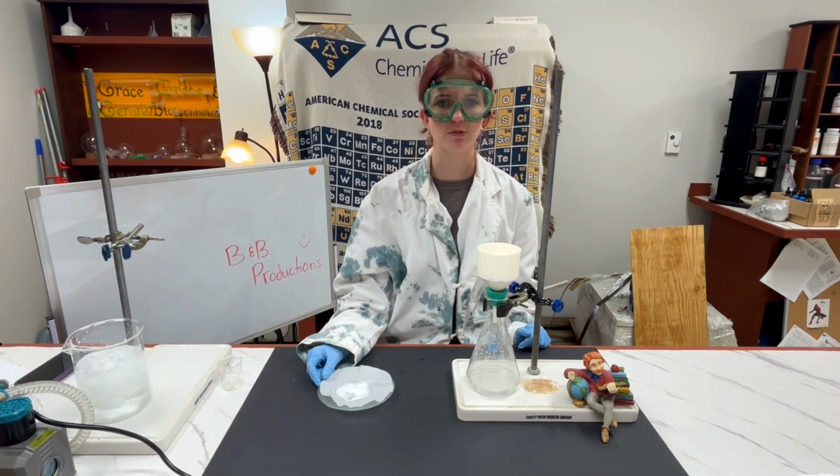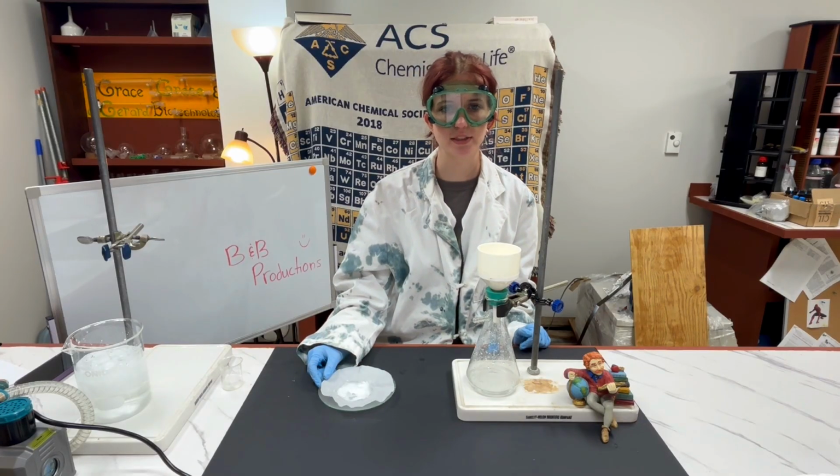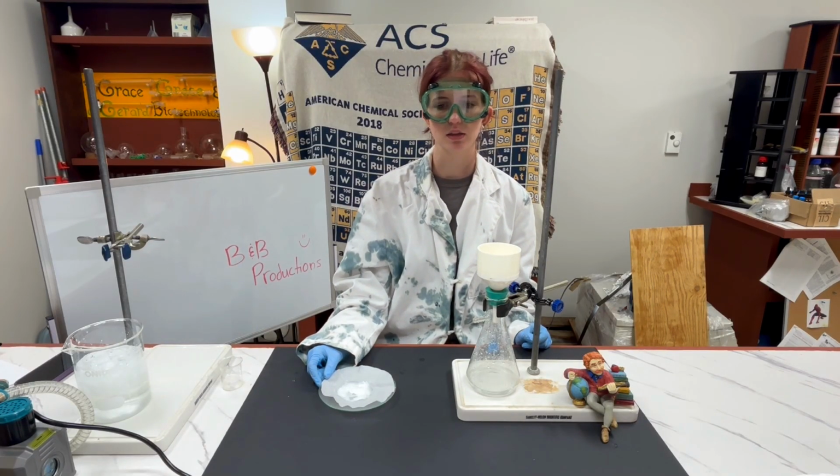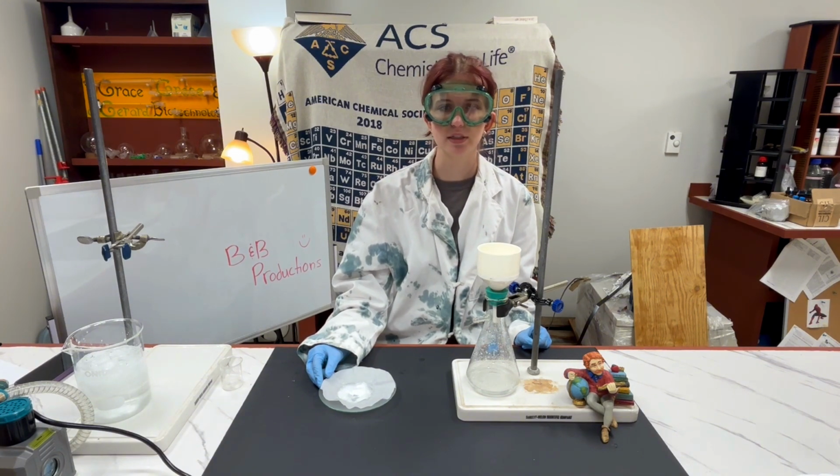Once your crystals have been filtered and washed, transfer your product in your filter paper to a desiccator jar for drying. Let the product dry until your next lab meeting. In your next lab meeting, you should be ready for taking weights and melting points.